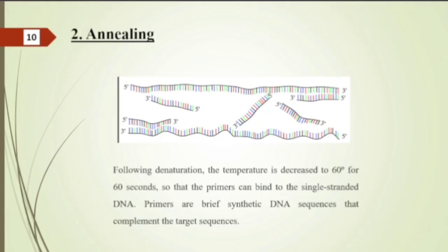Here you can observe the primers which are attached to the single-stranded DNA.